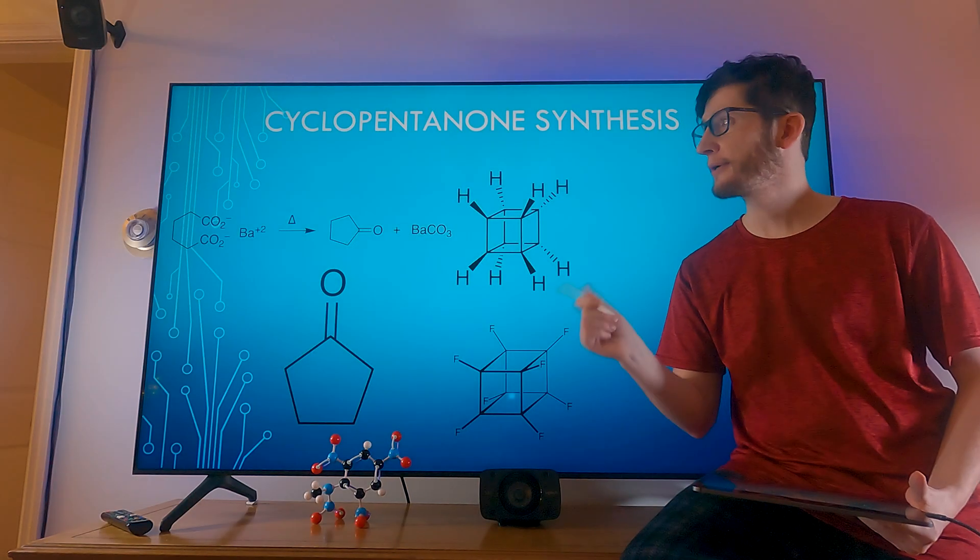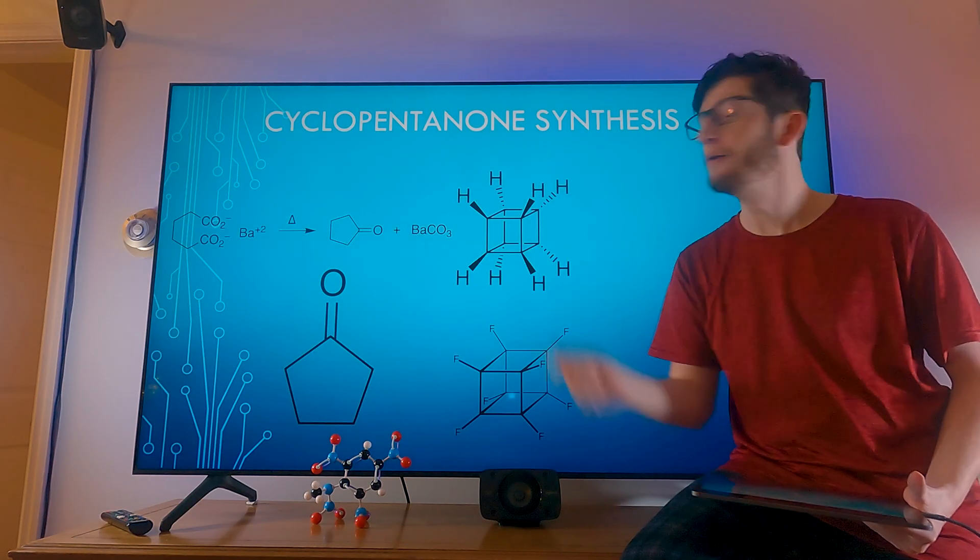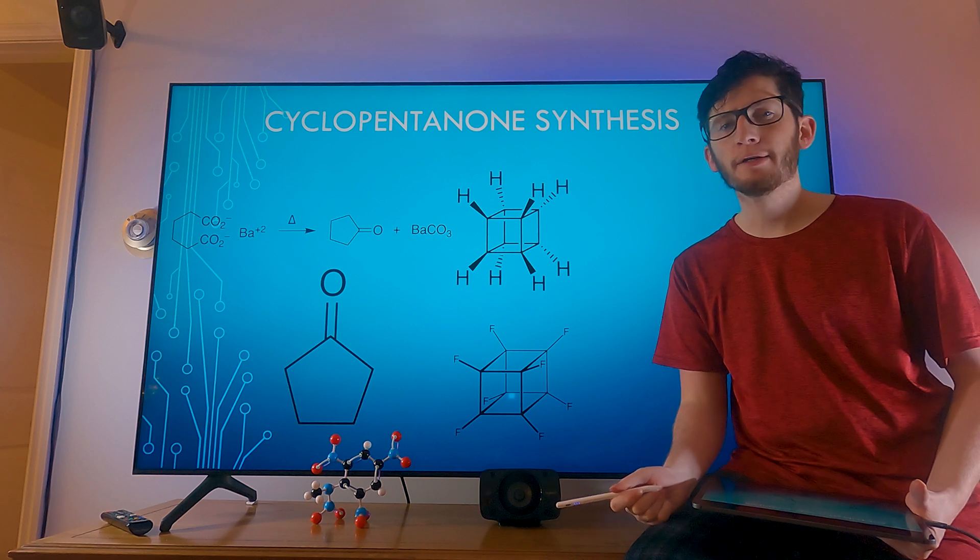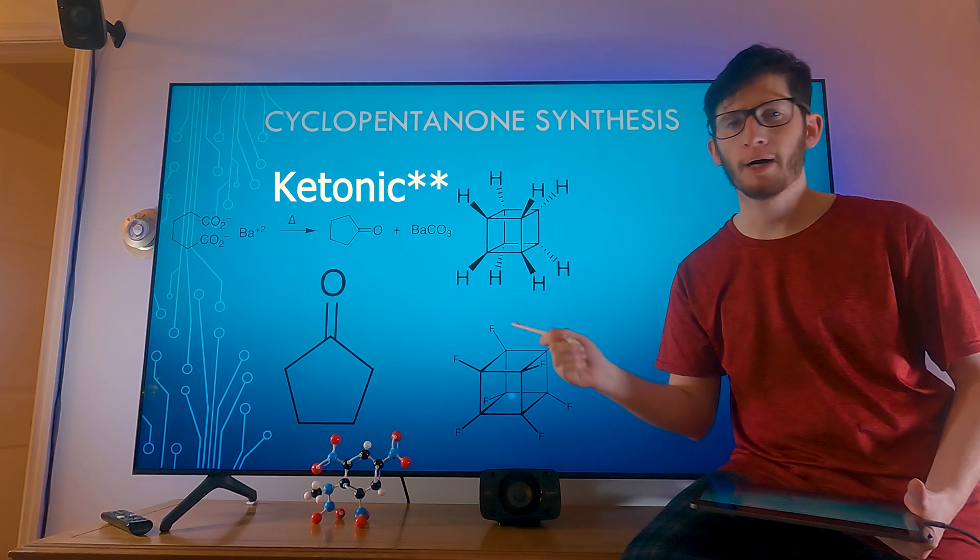Okay, so today we're going to be making cyclopentanone. This is going to be made through a catalytic decarboxylation reaction.